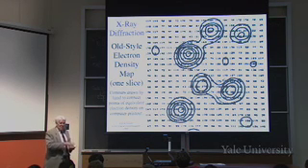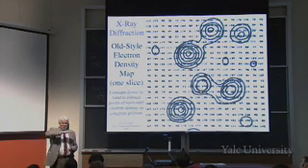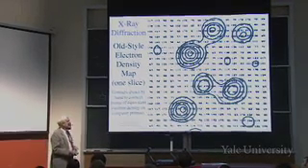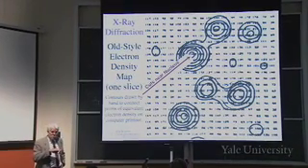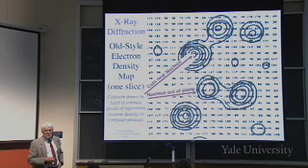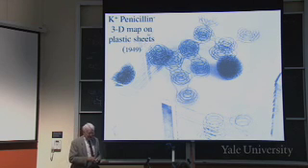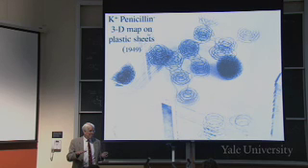Now, sometimes the particular slice you're working in went right through the middle of an atom, so you got very high electron density. Sometimes it just barely touched the atom, right? So you see here that this particular slice was very near the nucleus, so we got high electron density. But that one, the nucleus was not in this plane, so you just got a little glancing blow at it. Okay? But you could draw these things on acetate or plastic sheets and stack them up, right?